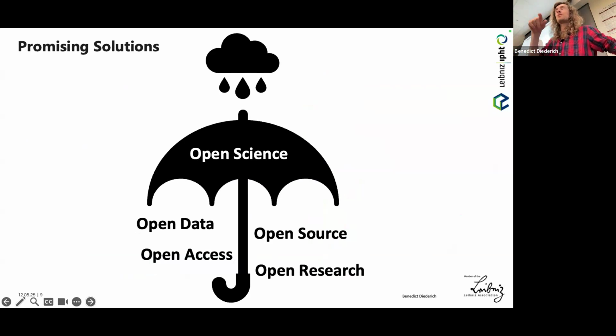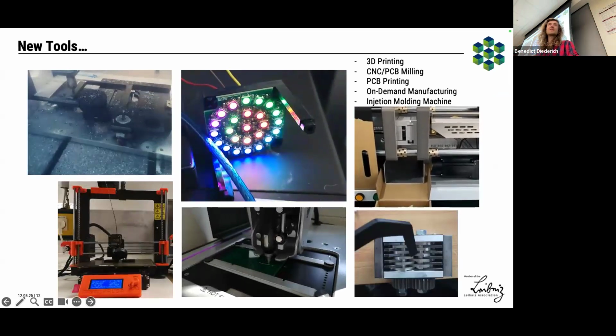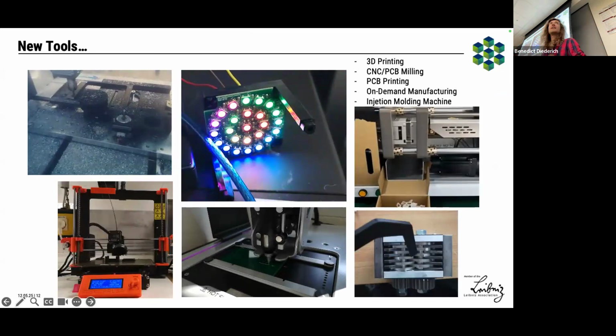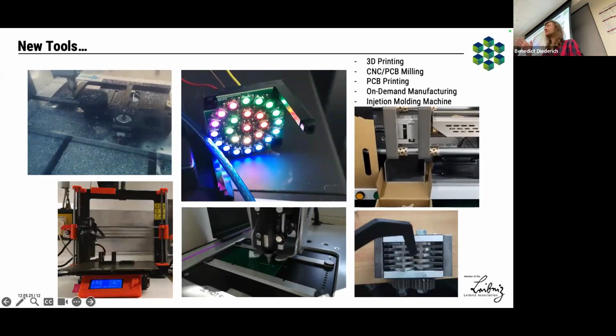Now, since I'm part of the company Open UC2, I'm still doing the same thing, but not in the research context anymore. The cool thing is that we can do all these things now. We have all these tools available, especially 3D printers. Looking to your right-hand side, there's a Stratasys, which I think was dominating the market until about 2011.